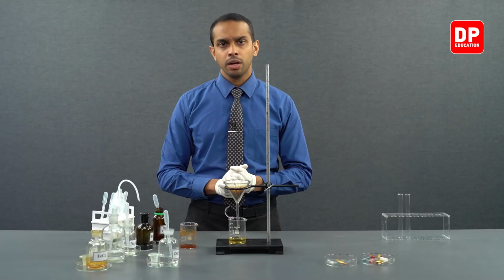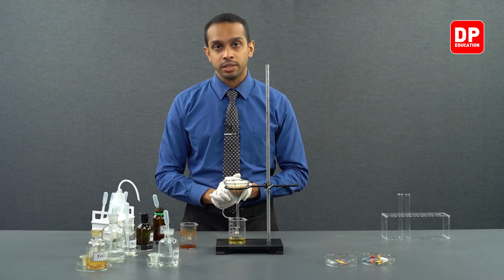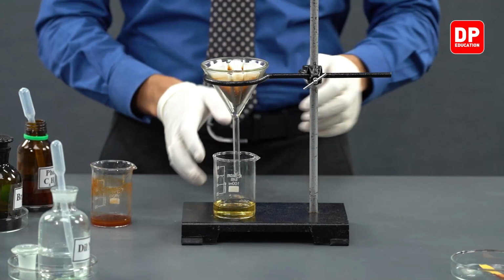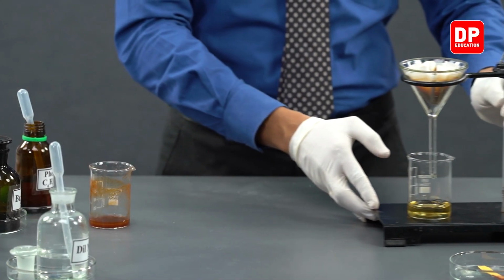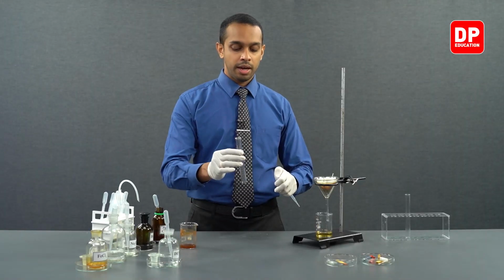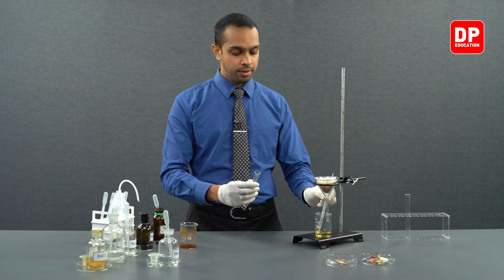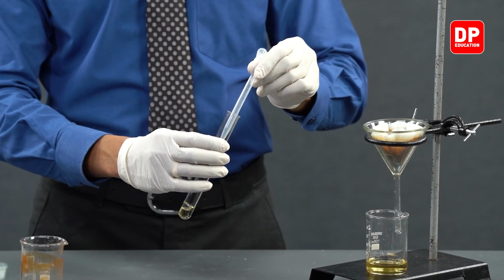Now let's add phenol to this ferric chloride solution and see what we would observe. We will take a test tube, and to this test tube I will be taking a small amount of ferric chloride solution. This is our neutral ferric chloride solution.